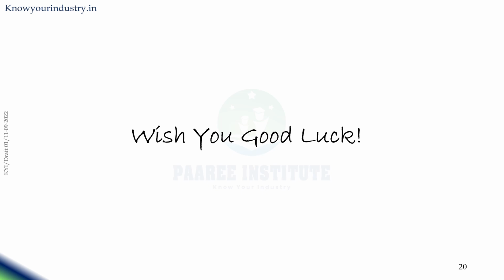In detail, we will see the method development and validation of these analytical methods in different upcoming modules.